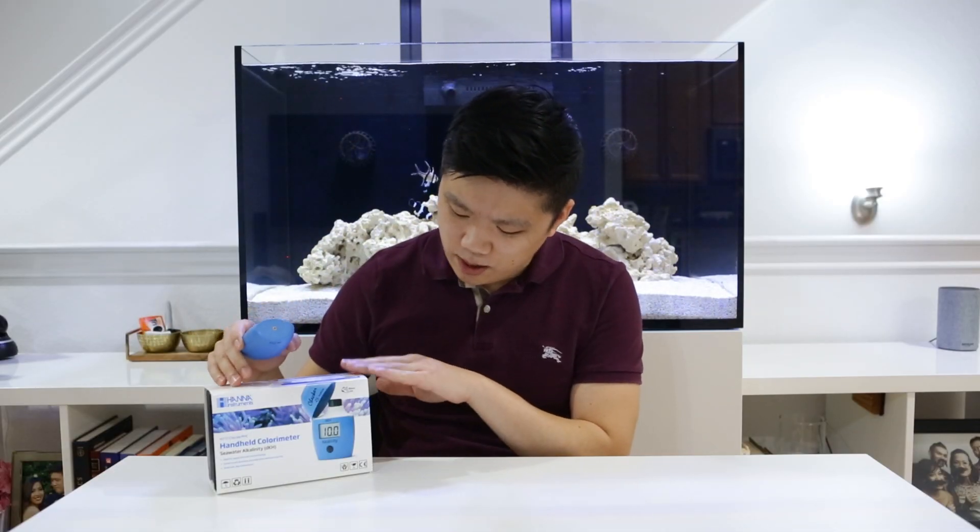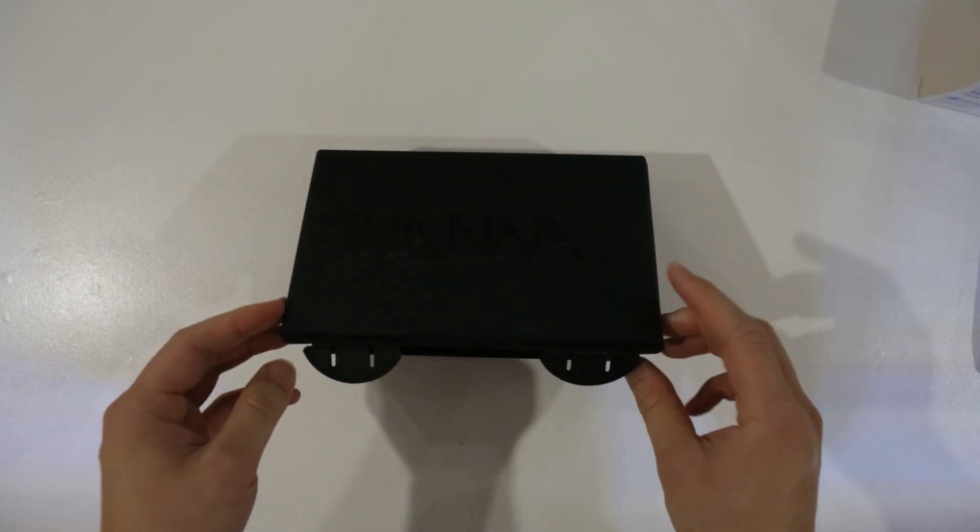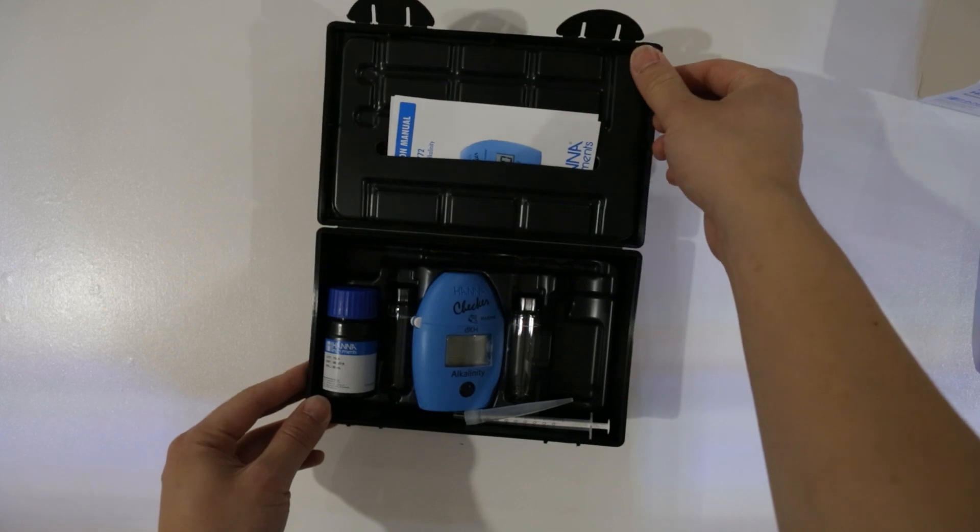I also like that it comes with a really, really nice hard case box for the reagents, for the pipettes and the checker itself. And so it gives you something to store it in and put it away, and that's a really nice bonus.